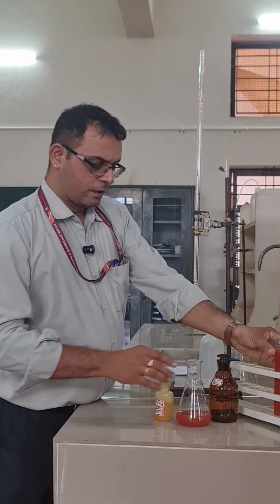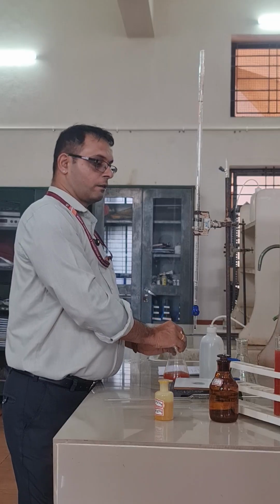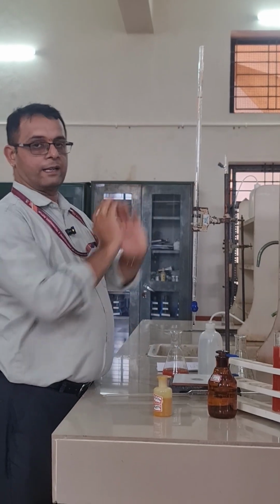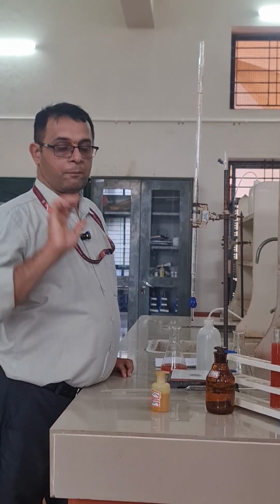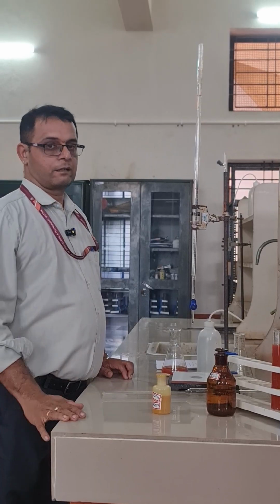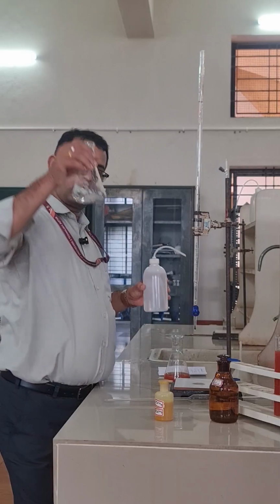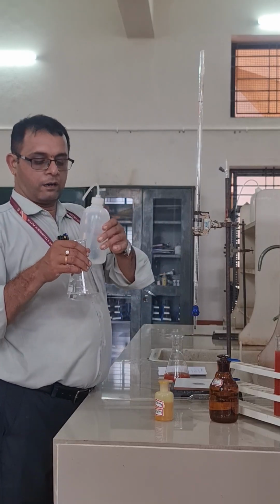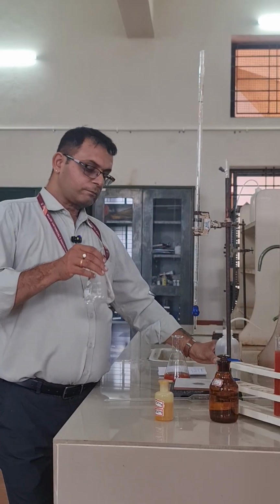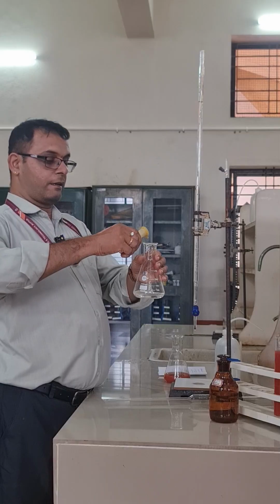Next, this is for the sample. Note down the volume of AgNO3 which is consumed. I have to do 3 trials, a minimum of 3 trials, until I get the accurate answer, right? Next, once again in the conical flask, I will take 25 ml of distilled water, right? So for the distilled water, the same procedure is repeated.